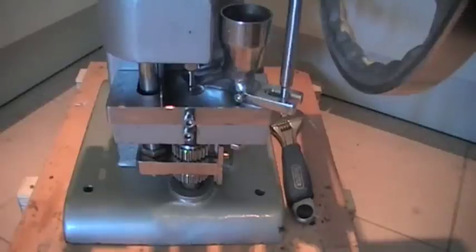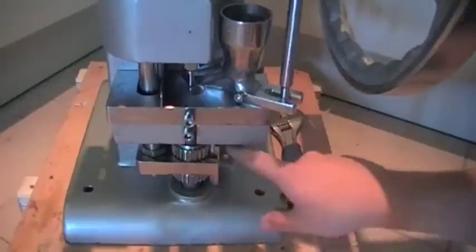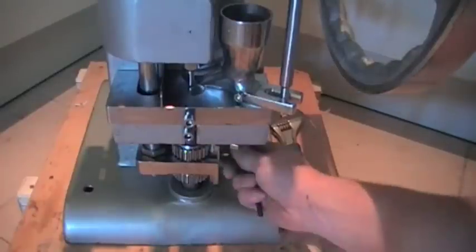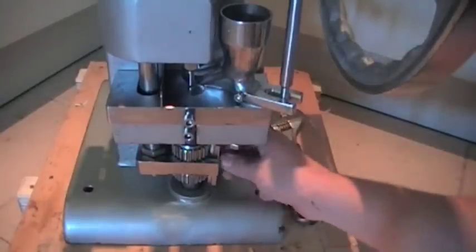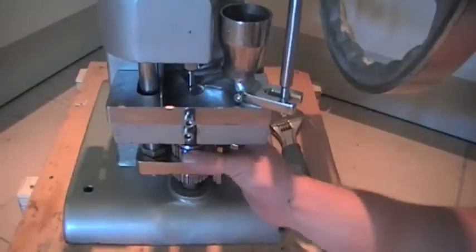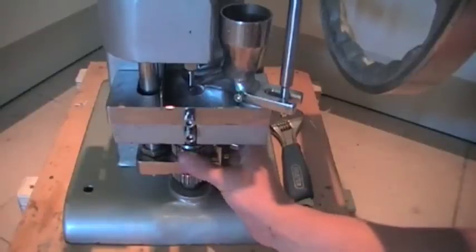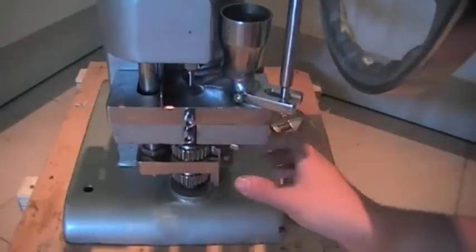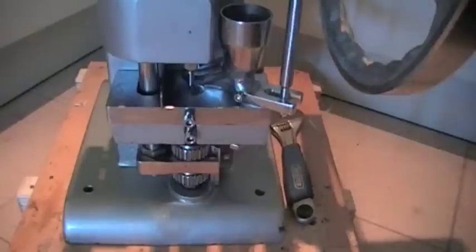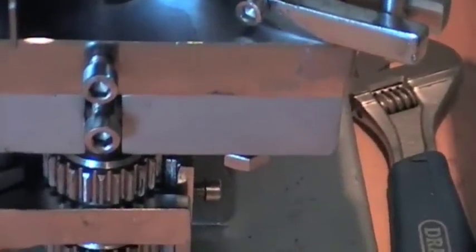So the first thing we're going to have to do is lower the ejection height. All of the heights are controlled off this side pin here, and there should be a little bar and an allen key holding it. The first thing you want to do is loosen that off, so that you can get to your nuts and adjust them. If you spin the top bolt towards the right, that will move your ejection height down, as it is in this scenario.